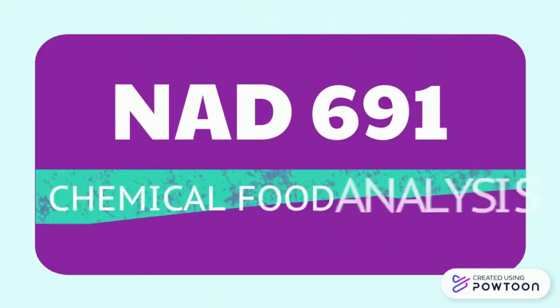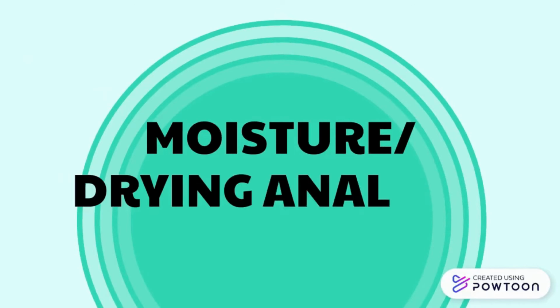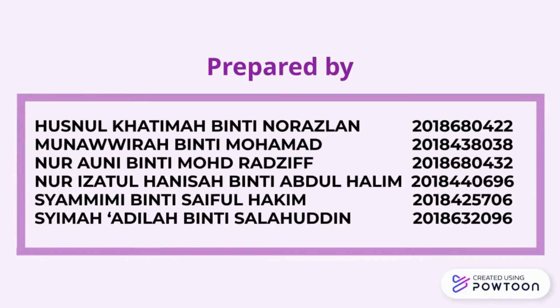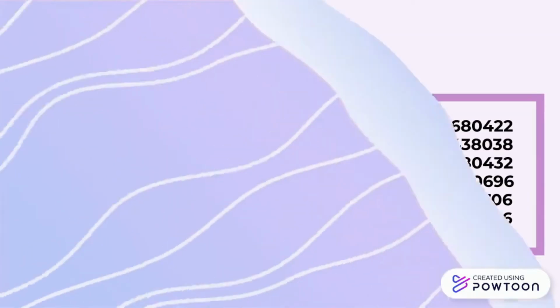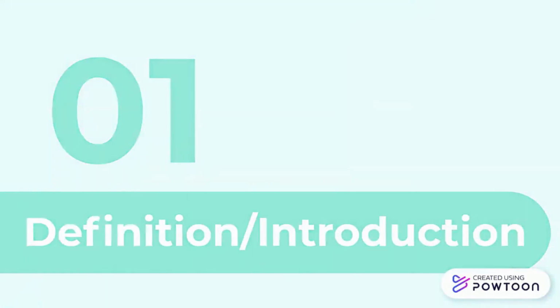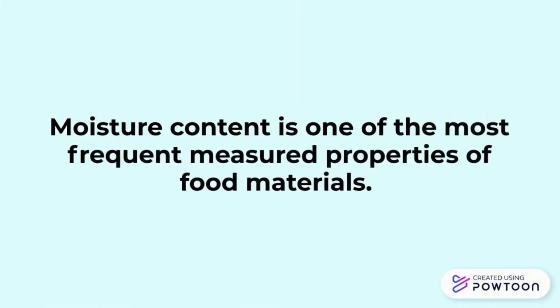In this video, we will share about the moisture and drying analysis. Moisture content is one of the most frequently measured properties of food materials.